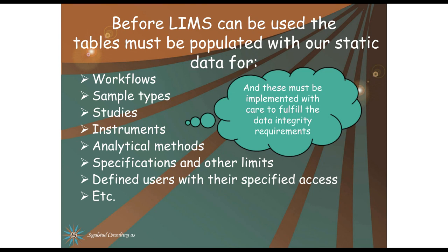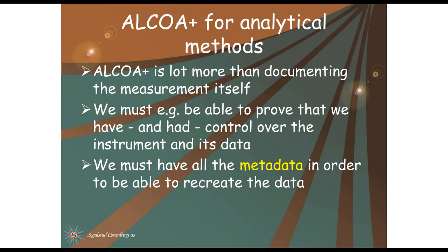Before LIMS can be used, the tables must be populated with our static data for workflows, sample types, studies, instruments, analytical methods, specifications and other limits, and the defined users with their specific access. And all of these must be implemented with care to fulfill the data integrity requirements.